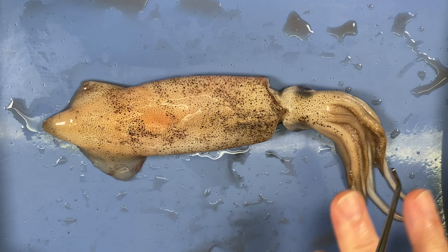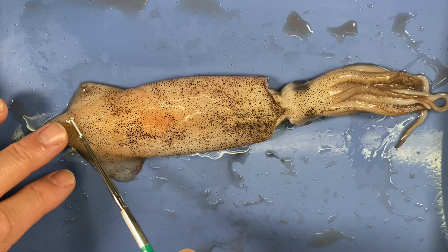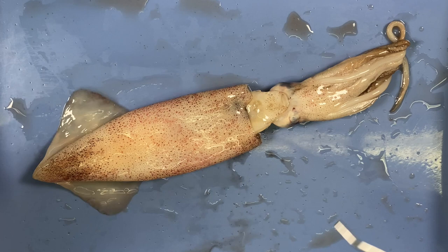Let's look at some external characteristics. Let's make the distinction between dorsal and ventral surface. This is its dorsal surface, and I'm going to flip it over — that's its ventral surface. As is typical for many animals, the ventral surface is often less darkly colored and less camouflaged. With these guys it shows really nicely — the dorsal surface is darker and the ventral surface lighter.